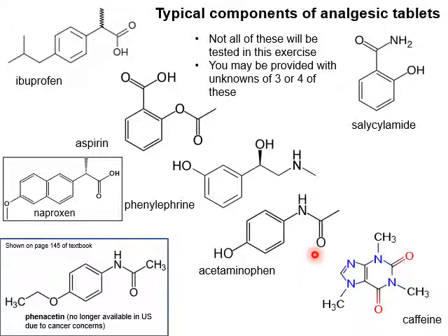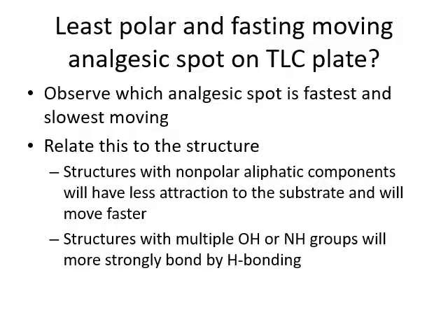So in a TLC plate, the stationary phase is silica, because of the SiO on the silica, so polar compounds will be held, however the less polar will move faster. As I've mentioned, less polar compounds on a TLC plate will move faster. But the polar compounds, because of the OH or NH groups, which cause hydrogen bonding with the silica, will move slower.